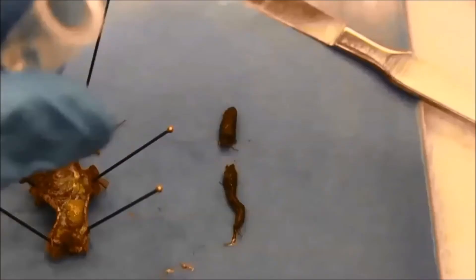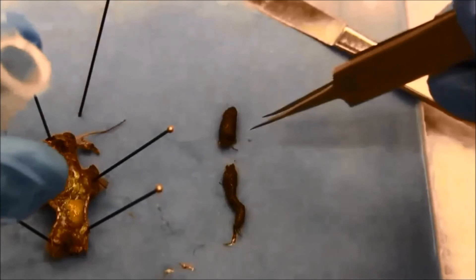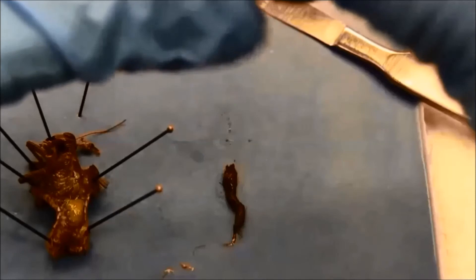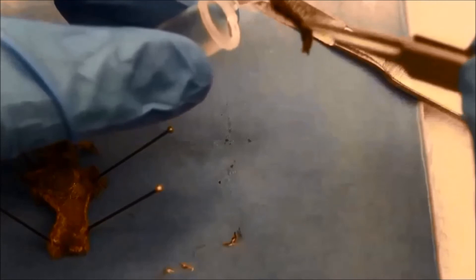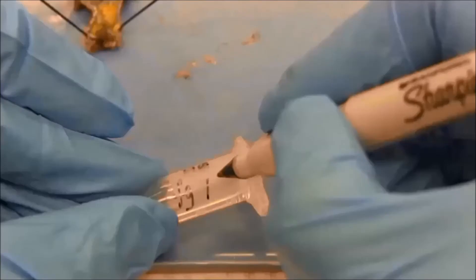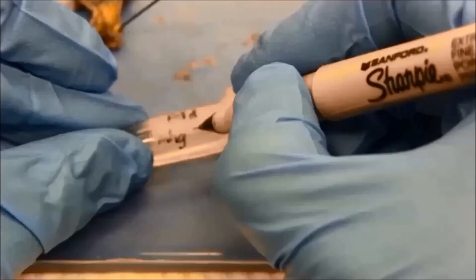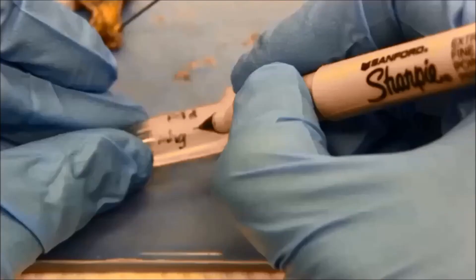Then I need to place the fore gut, mid gut, and hind gut parts separately into microcentrifuge tubes with 70% ethanol and store them overnight before the DNA extraction. You can skip this step if you immediately proceed with DNA extraction. I label the tubes. This was a differential grasshopper after 7 hours post-ingestion.